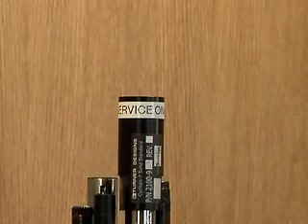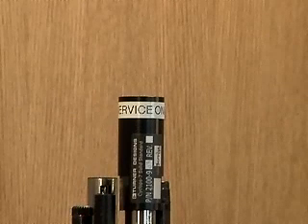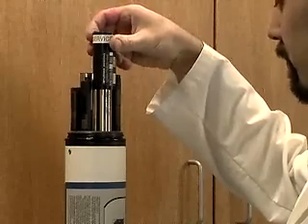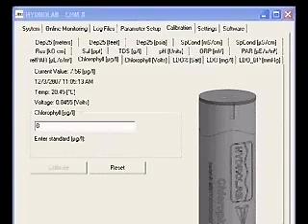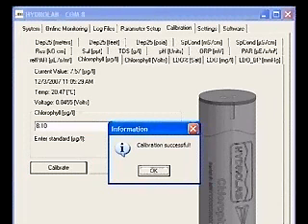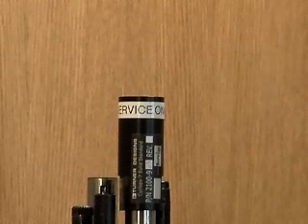When the results of the extraction are known, the chlorophyll A sensor is recalibrated using this value. If you are using the solid standard, perform the same zero calibration as before. Rinse and dry the sensors, place the solid standard over the fluorometer, and wait one minute for the readings to stabilize. Type the value of the extraction into the box and click Calibrate. A calibration successful message will appear. If the solid standard is not adjusted, it can be used on this specific sensor for future calibrations or to check for drift. Record the extracted value and keep it with the standard. The chlorophyll A sensor is now calibrated.